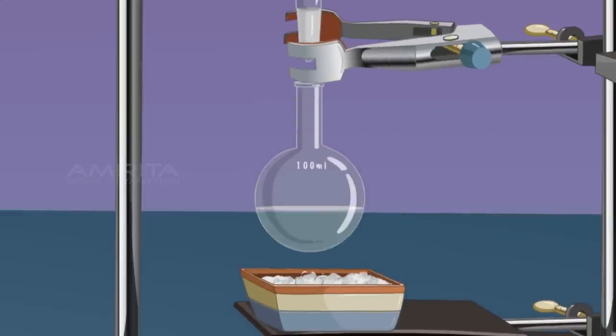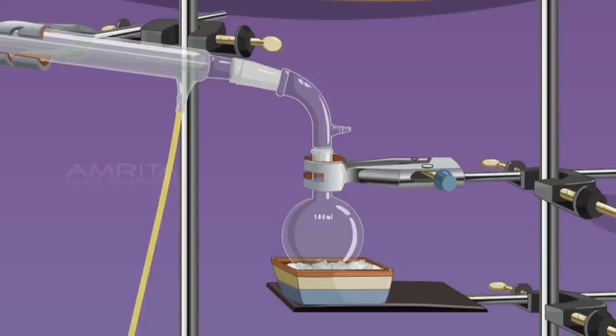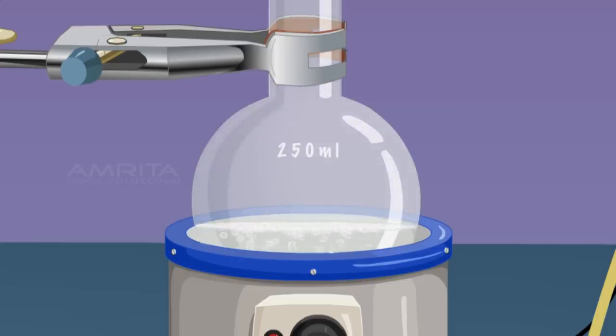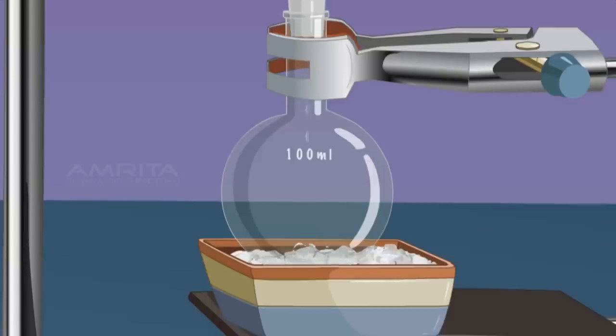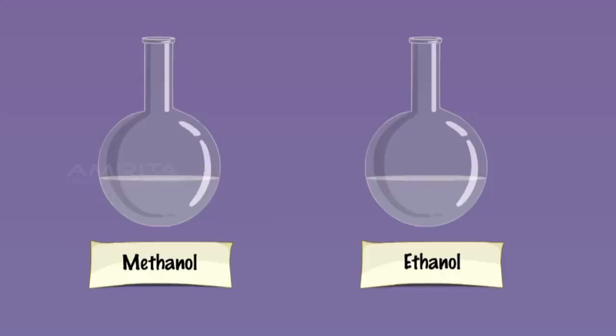Remove the RB flask containing methanol and connect a new RB flask to the vacuum adapter. Again, set the temperature of the heating mantle to 78 degrees and heat the contents of the RB flask. At 78 degrees, ethanol vaporises and the vapours rise through the fractionating column and pass through the condenser, and condensation takes place and ethanol gets collected in the receiver flask in liquid form. Fractional distillation is used for the separation of two or more miscible liquids for which the difference in boiling points is less than 25 K.